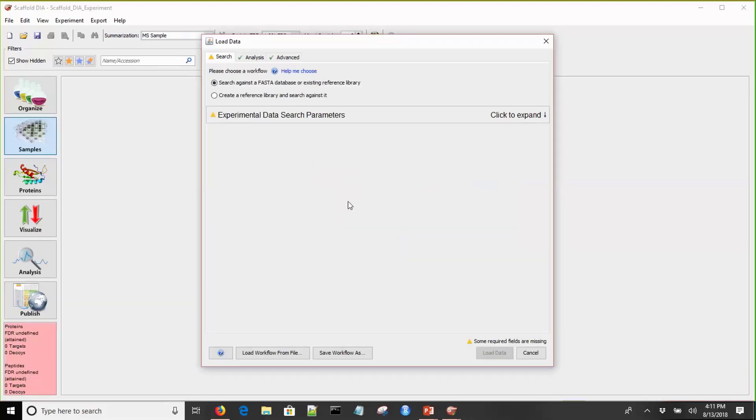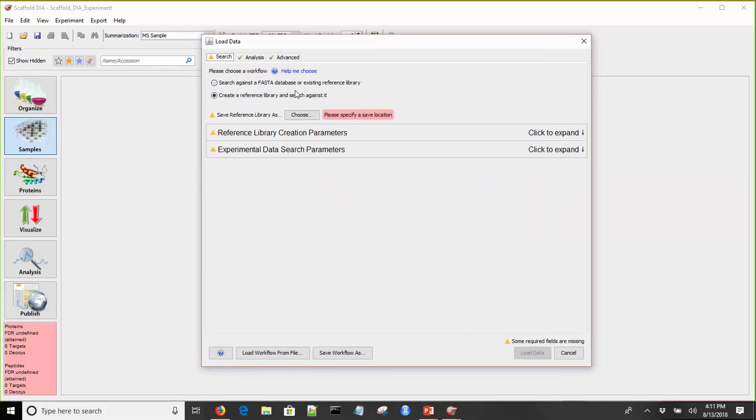This is the workflow dialogue. We are going to use the second workflow to create a reference library and search data against it. You'll see the yellow triangles scattered throughout the workflow dialogue. These indicate that the user's attention is needed in order to set a parameter. Once all of these yellow triangles are cleared, you can proceed with searching, and they're replaced by green checkmarks.